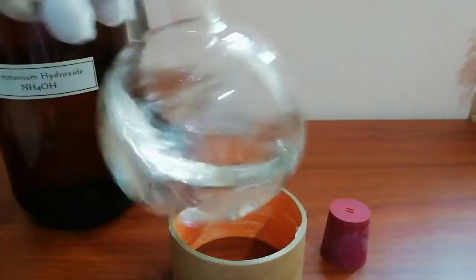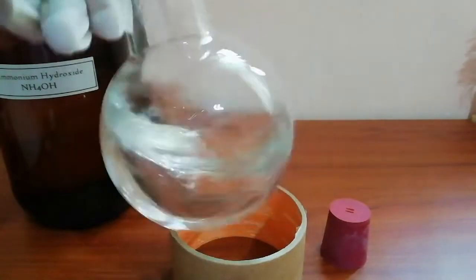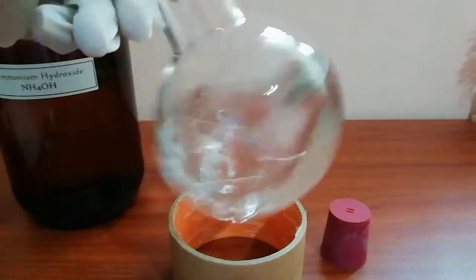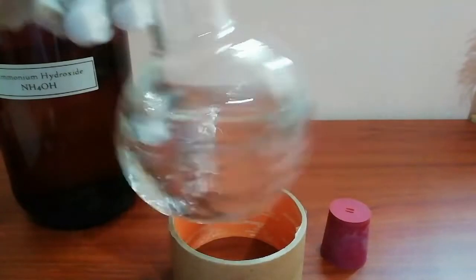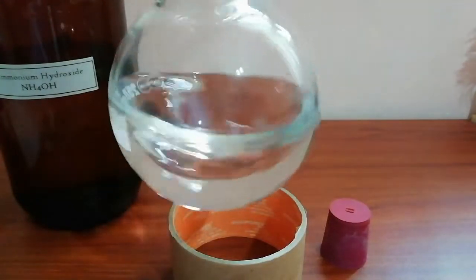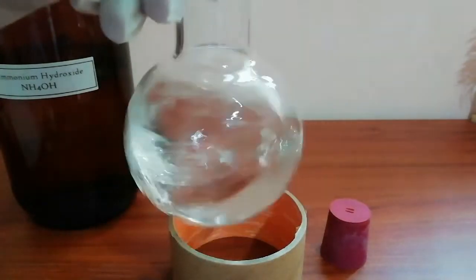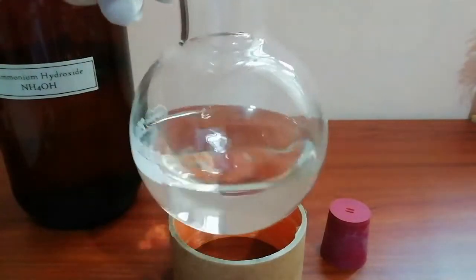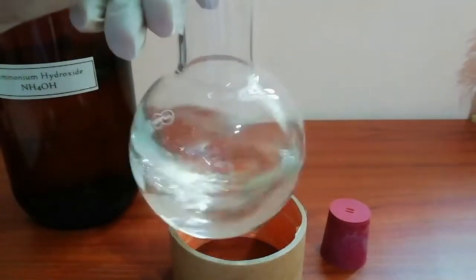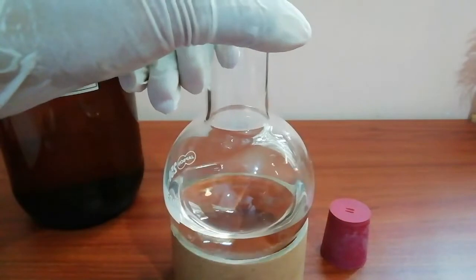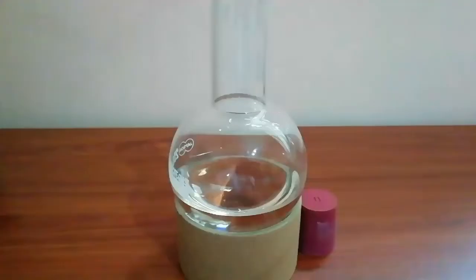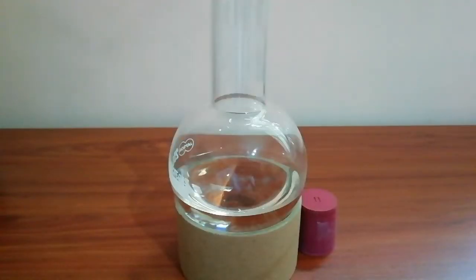Two milliliters of ammonia was not enough to dissolve all the silver oxide, so I add more ammonia until all the silver oxide dissolves. Now you have a nice clean solution. This mixture is called Tollens reagent.